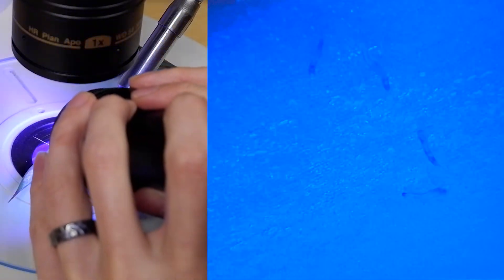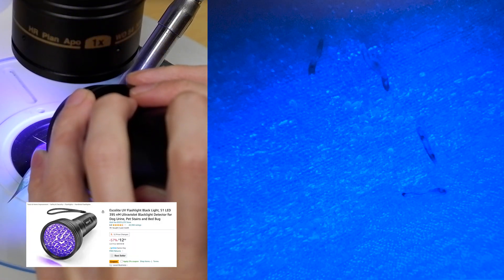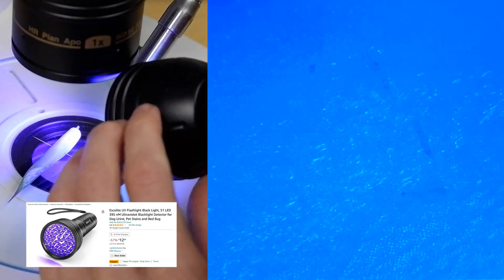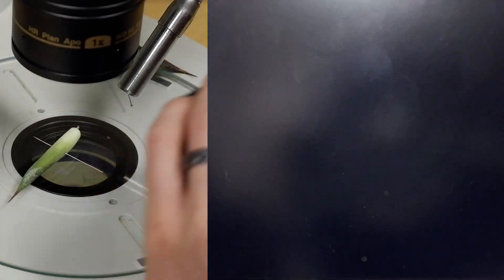This is one that we don't recommend. You can see the mites, you can see some eggs, but there's not a lot of contrast. Here's another one that we don't recommend. This is the Ecolite. The Ecolite seems to show the adults a little bit better, where they're popping a little bit more. You can sort of see their color, but you can't see the eggs very well. And again, everything is sort of the same color of bluish.